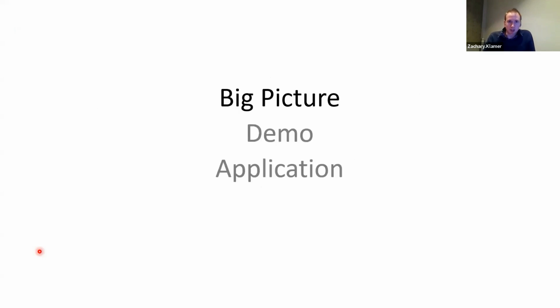Now, my tool probably needs a little more background than some of the previous tools in these seminars so far. So we'll spend the first few minutes here talking a little bit about the big picture, as well as how the back end of the tool works. Then we'll jump into a live demo. And then we'll come back here to talk a little about applications and how you might use CarboGrove yourself.